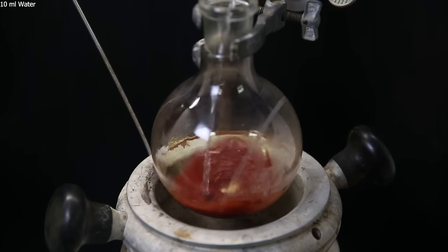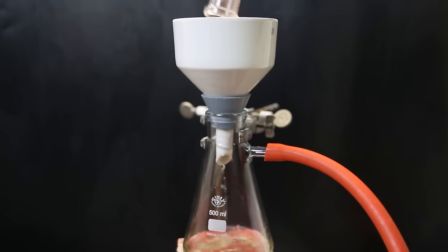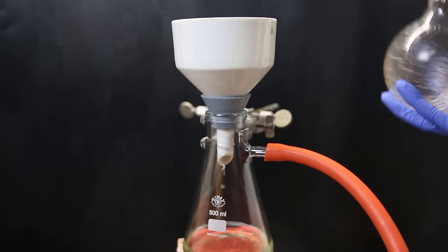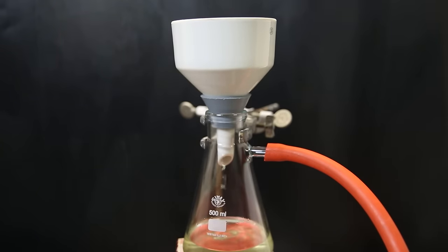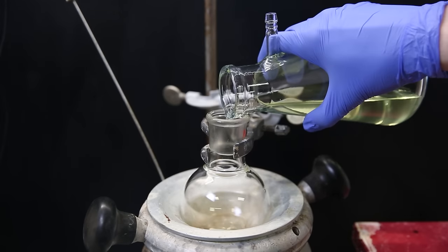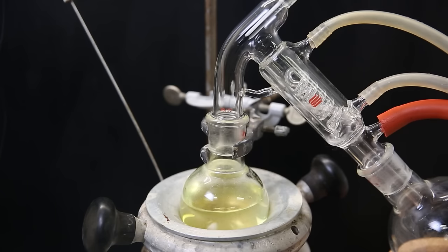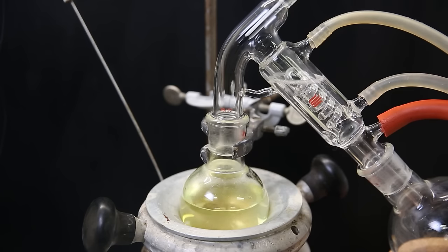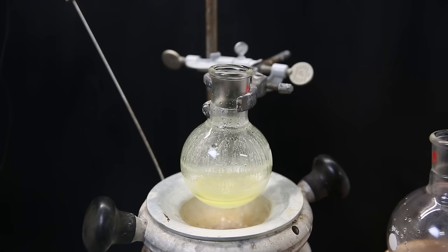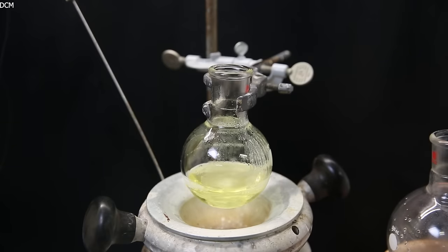I then add 10 mL of water to make sure it has all precipitated out. I then filter the mixture with vacuum filtration through a Buchner funnel with a paper filter, and the red-brown residue is washed with some 25% water in methanol. I take the light yellow filtrate and put it in a flask. I set it up for short path vacuum distillation again, and remove all of the methanol. After that, a bunch of yellow stuff and water is left behind, in which it is not very soluble. So I add some DCM to dissolve it all, and we see it becomes clear again.